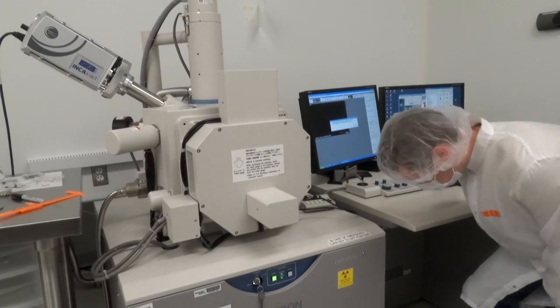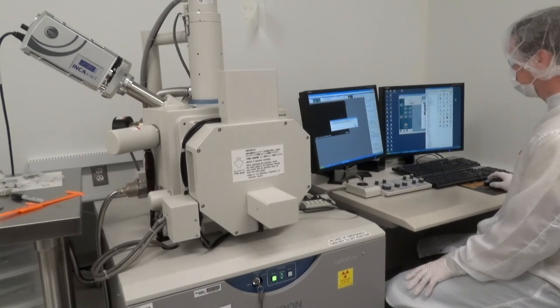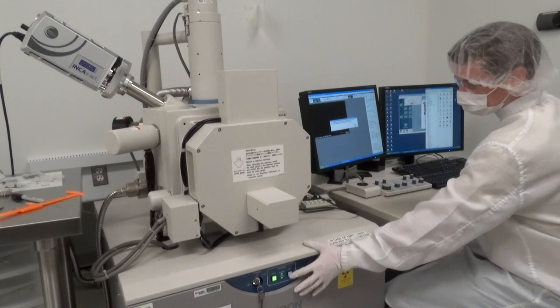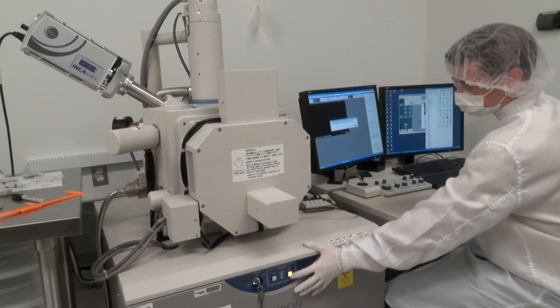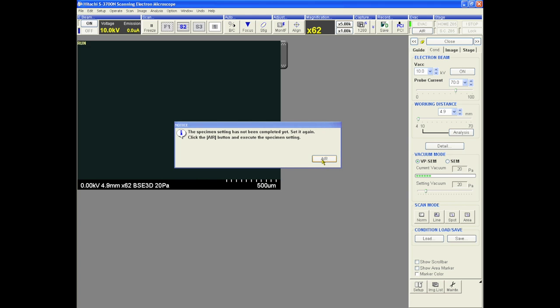The first step of using the VPSCM is to vent the chamber if it is not already vented. To do this, click Air either in the center of the display screen or use the physical button on the front of the SEM. The chamber will vent during the sample preparation process.